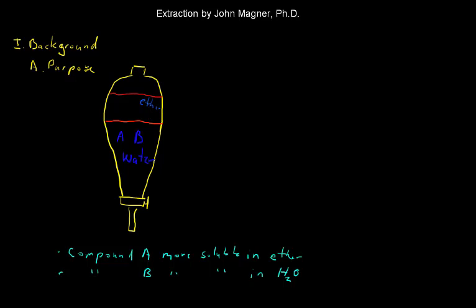The next thing that we're going to do here is add a stopper. So we can shake this thing up. So there's our glass stopper. And normally you kind of turn this upside down and shake it. So we're going to shake this thing up and down vigorously to make sure that the solvents are thoroughly mixed.